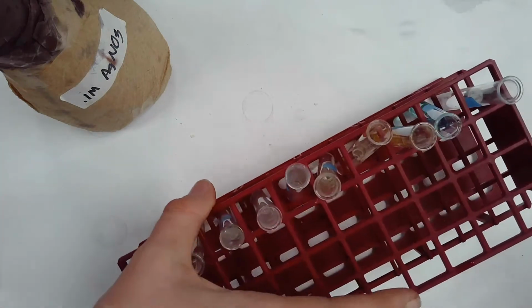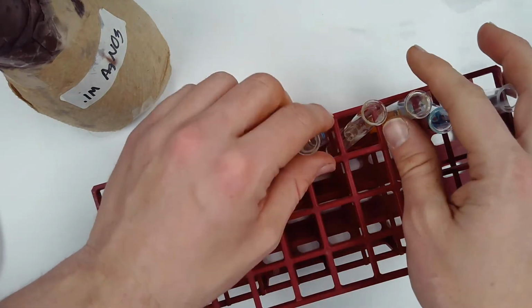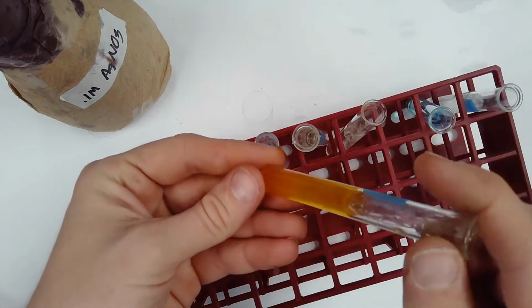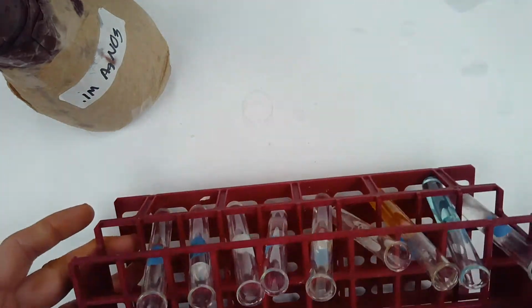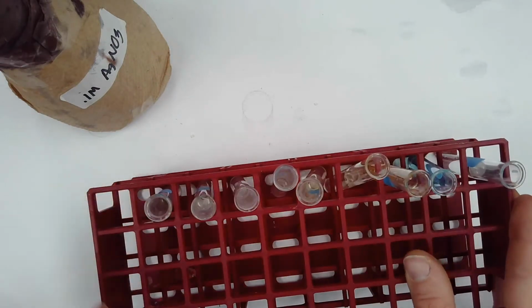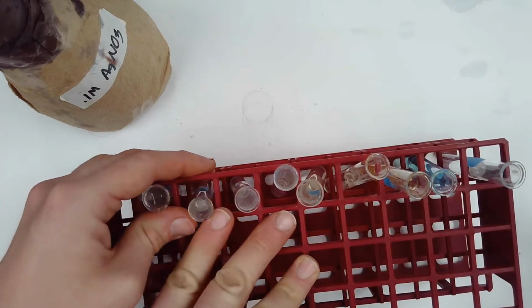So all of that work has netted us all our test chemicals. Now, you're not going to see them in this form again, but I wanted to show you that, right? A few of them here, like the iron nitrate, do have color. Most of them, though, as you'll notice, are clear, water-looking liquids, which is a common issue in a lab. So I've been careful and I've written down what everything is in order so I can keep track of that.